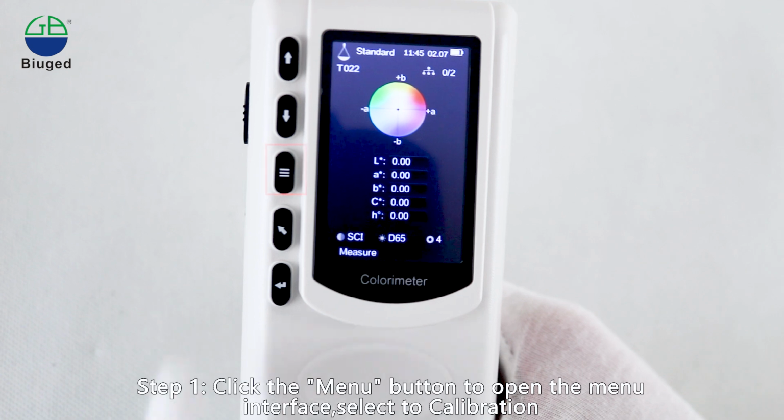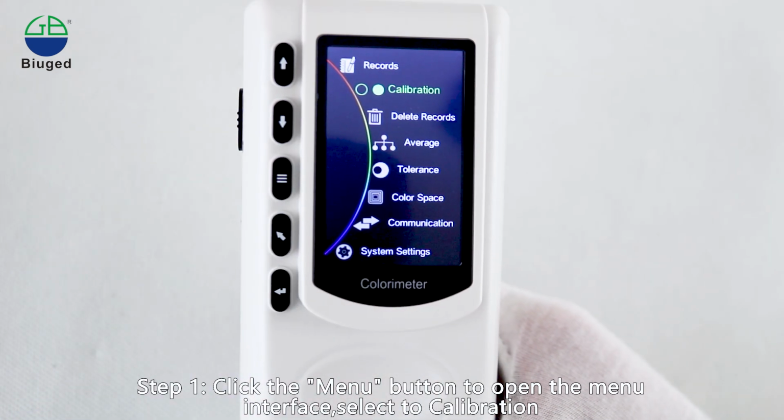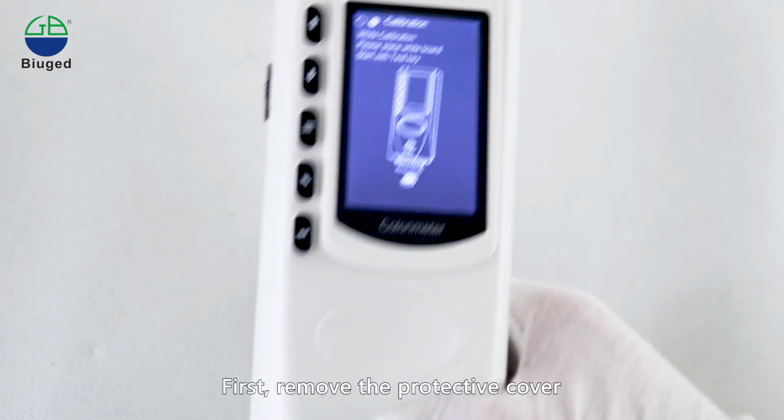Step 1. Click the menu button to open the menu interface. Select Calibration. First, remove the protective cover.